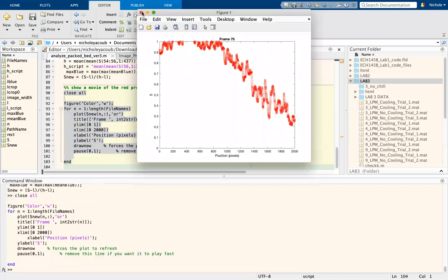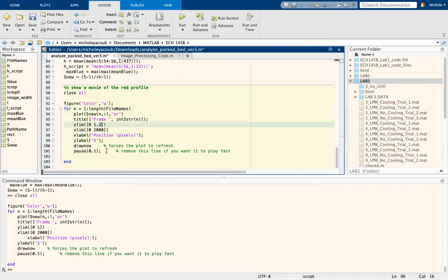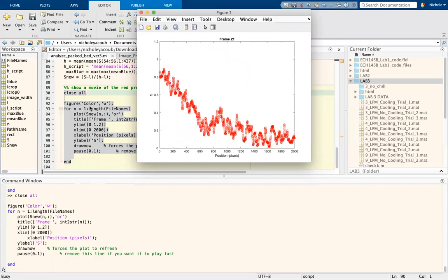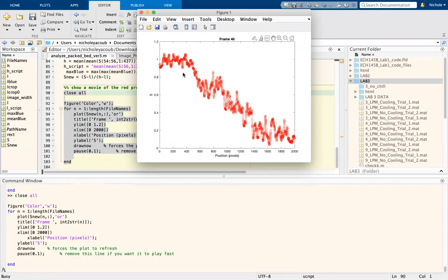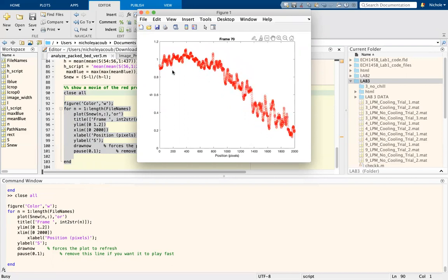Right. So make sure when you do this, though, that you don't have this issue that I'm having right now where the values are actually cut off. You might have to increase your range and then explain why you're going past 1, right? There are outliers. You needed to go past 1 in order to actually show a good saturation trend. There's always a good explanation for something as long as you can find it. But again, just let this run again. Make sure that you can see all the data throughout. You're getting that average 1 line there, and saturation is approaching closer to 1, like you would expect.